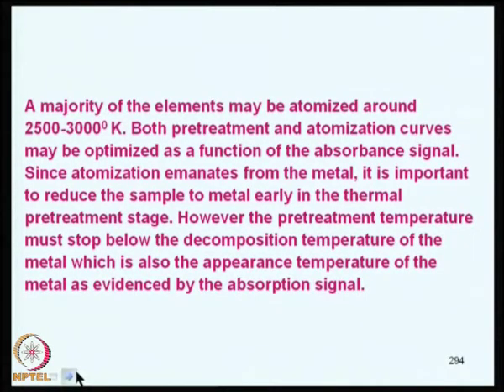Similarly, the atomization temperature should be as low as possible, so that the life of the graphite tube will be extended. Therefore, we would like to know the different conditions for each element, because for each element, the pretreatment and atomization temperatures would be different.